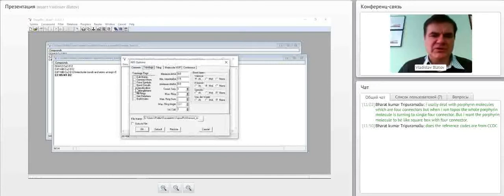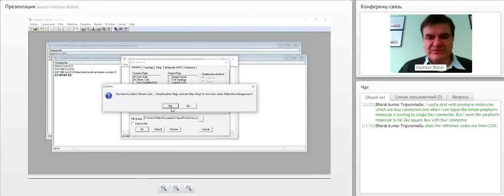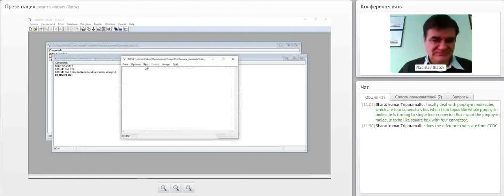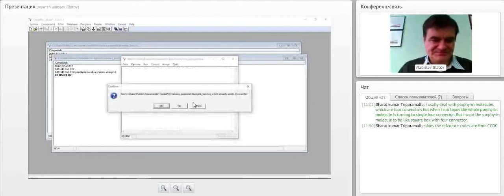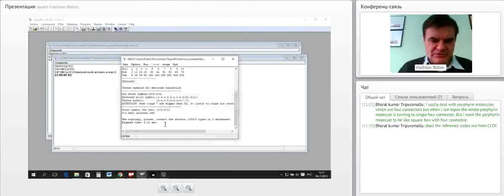Okay, run. I overwrite the old NMT file. I get again the new topology, and now I go to the client, open the file, this one.